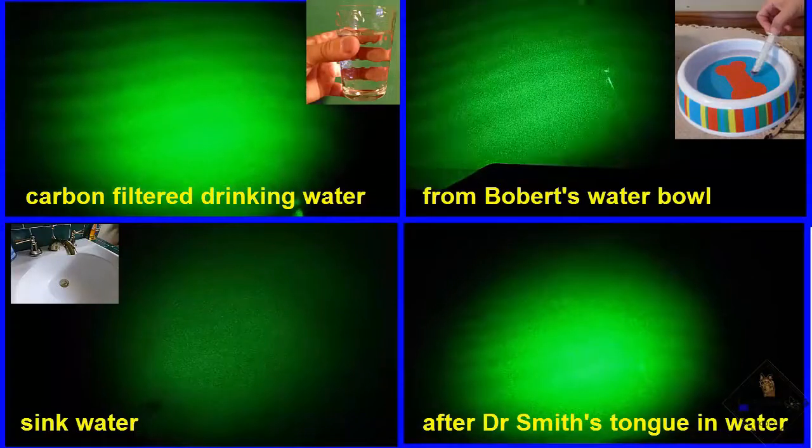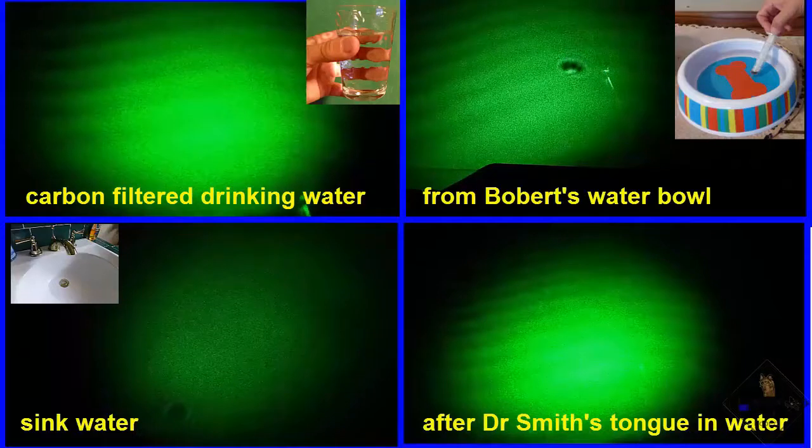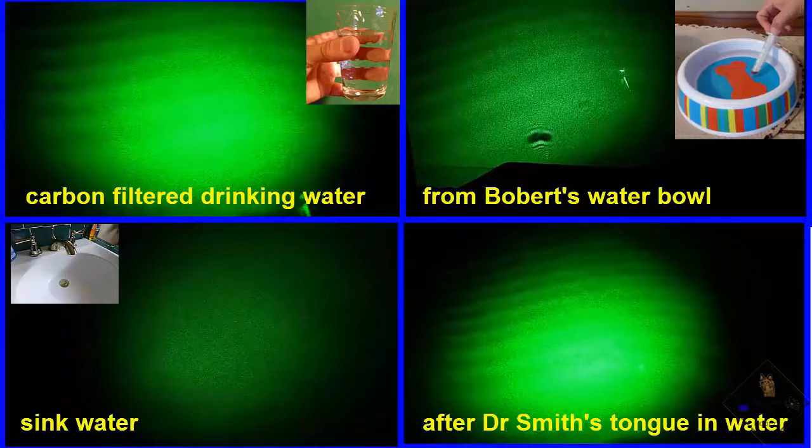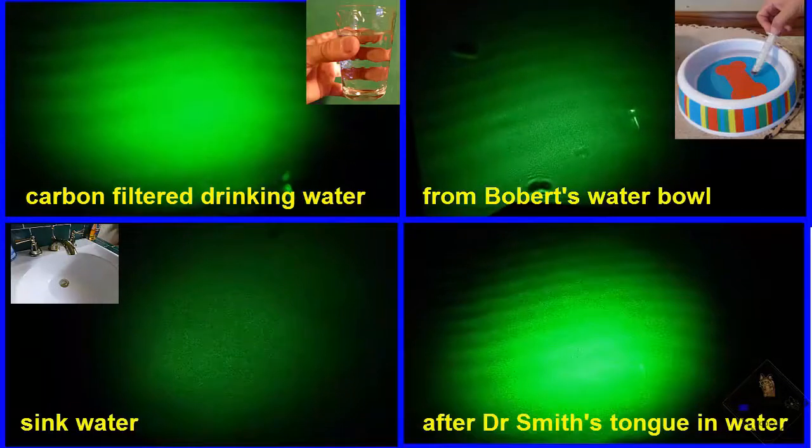The water source for all samples taken was carbon-filtered drinking water. It would be really interesting to try lake or pond water. Maybe even stagnant water. It would be fun to try a water bottle before and after sharing it with someone else. You may never share your water or soda bottle again.